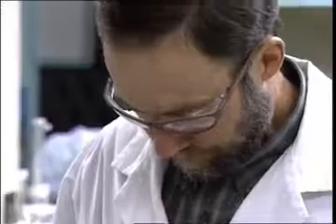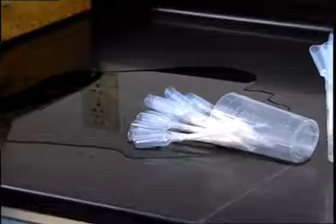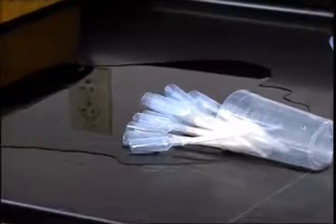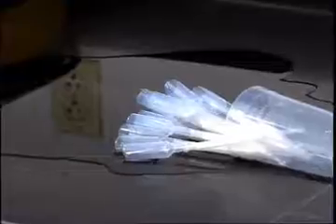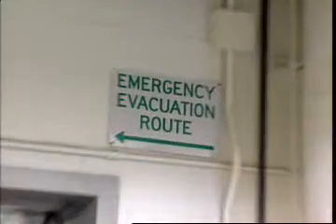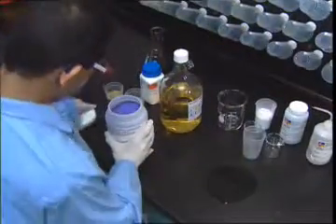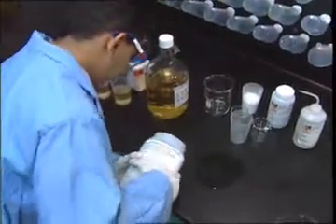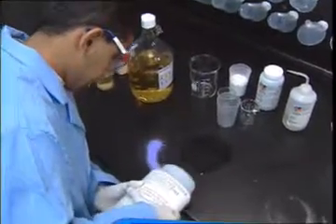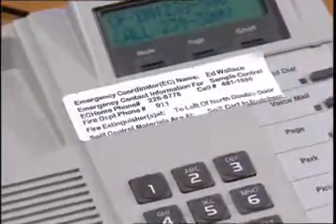Even at the best-run lab, with the most conscientious employees, accidents can happen. An accident in a lab or research facility could involve a staggering array of hazardous materials and hazardous waste that could inflict serious damage to the environment. For human safety and environmental protection, every facility must be fully prepared to deal with any emergency that could involve hazardous waste. Since many types of emergencies can threaten to spread hazardous wastes, the regulations require every facility to have plans and preparations for dealing with these emergencies quickly and effectively.